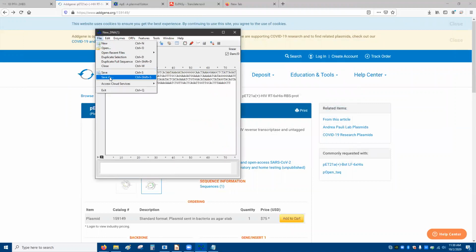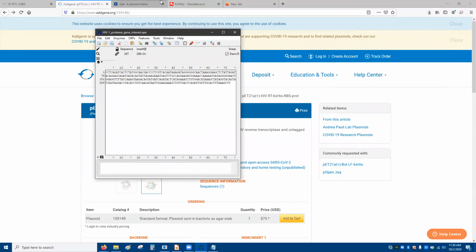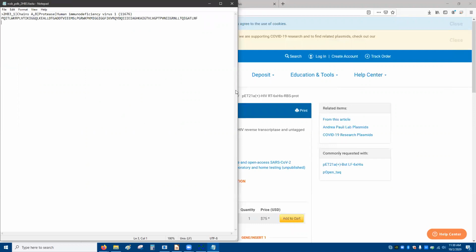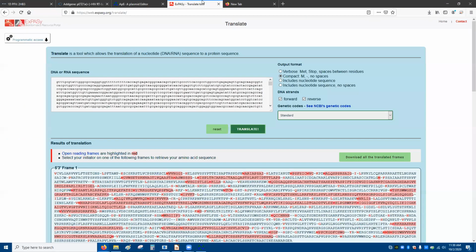I'm gonna say that as HIV1 protease gene of interest. Okay, now we're going to modify this file to match the other file we would like. So there's this guy. Oh, we don't need that right now. So I can always open that up later.